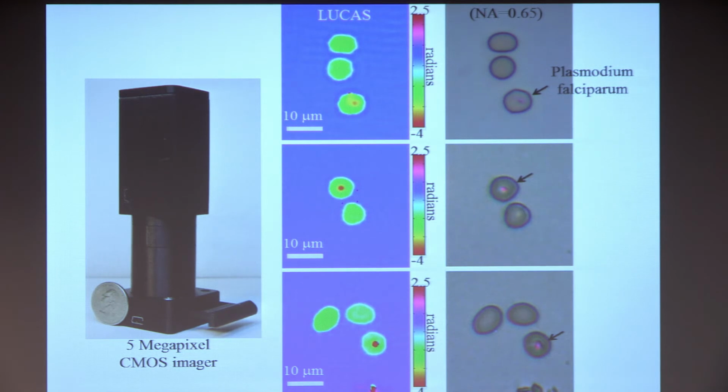Of course, there's a postdoc behind this kind of work. But you can see high-resolution images. In this case, you're looking at a blood smear, thin blood smear for malaria diagnosis. These are malaria parasites, Giemsa stain, that invade a red blood cell, and this is the same thing that you can see in a lens-free microscope, without, again, the bulky microscope.